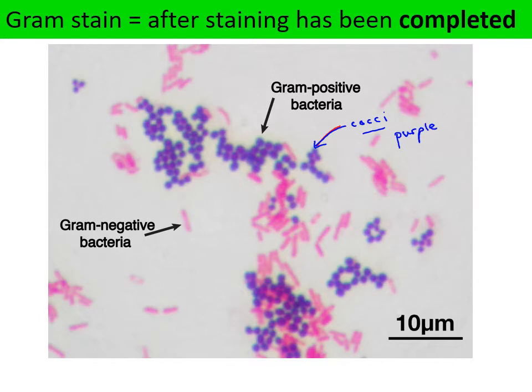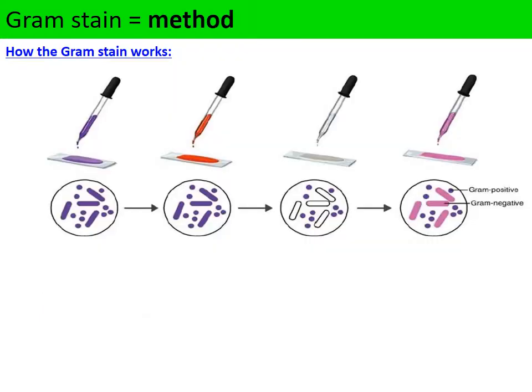And on the same slide we've got the different species here, and we can see in a reddish pink, we've actually got bacillus this time, and they stain the reddish pink colour. So I'll put the method on the slides in a moment, but we can see here there's a differential stain where some bacteria are purple, they're gram-positive, and some bacteria are pink. Now this slide is a quick overview of the gram stain method, but there's going to be a more comprehensive method on the later slides that we can have a look at in a moment. So this is an overview of the gram stain procedure.